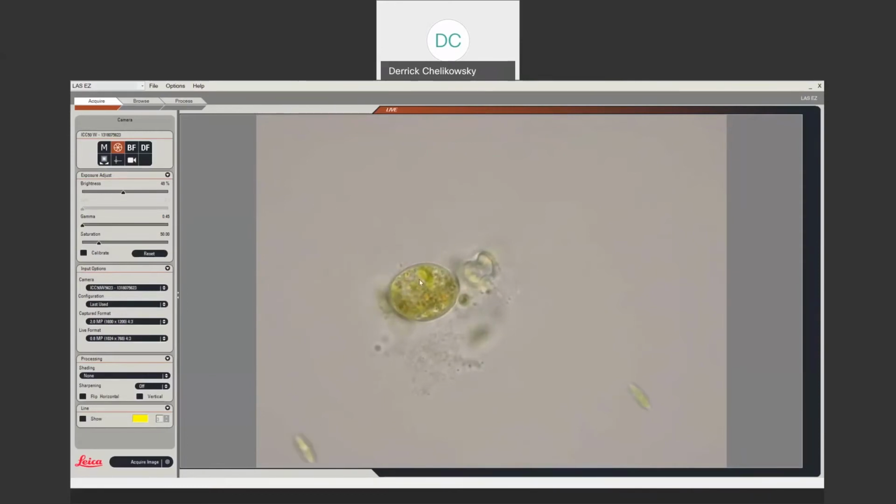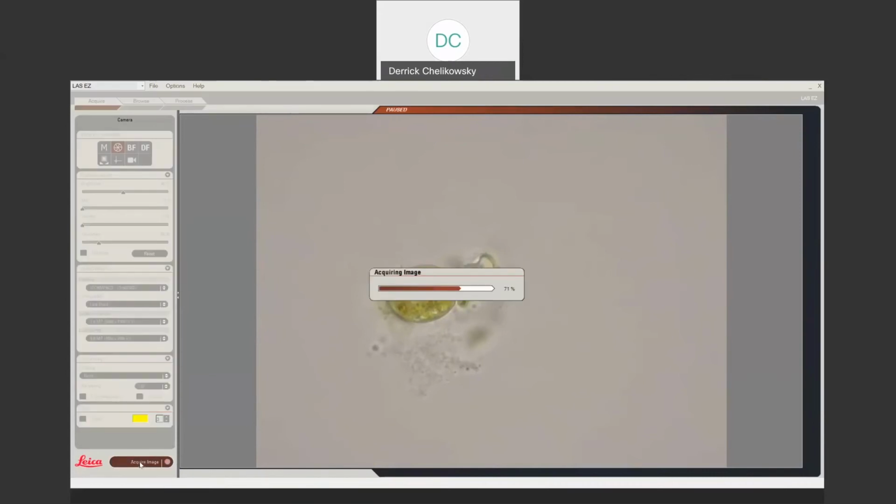Nucleolus. This here, this sort of half-moon shape, that's your chloroplast. There's several chloroplasts in the cell. And inside the chloroplast are pyrenoids. We are going to take a photo of this because this is absolutely gorgeous. Just gorgeous.